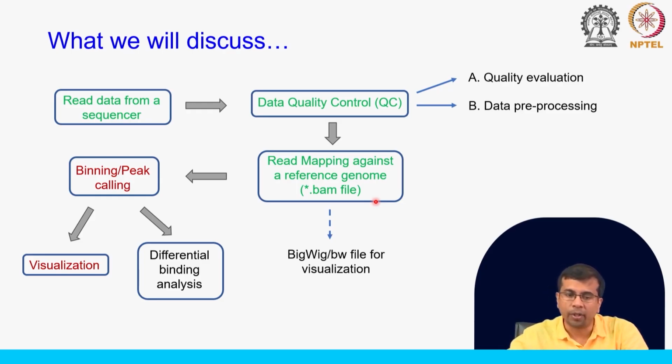One thing we need to remember, when you do the peak calling part, we'll have to have a control. So, peak calling will be done compared to a control sample. Okay. So, that control will be there, and it is usually the input DNA control, as I mentioned. And then we will look into the genomic tracks, we will see these peaks, the location of these peaks and where they are located, what are the genes that are present in those locations. So, we will take some examples and I will illustrate that in the hands on part.